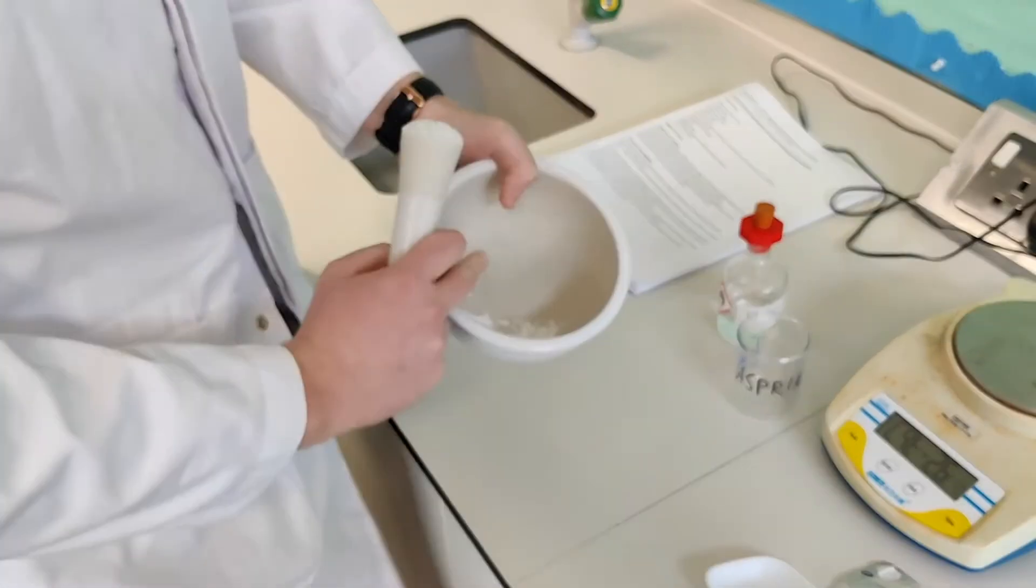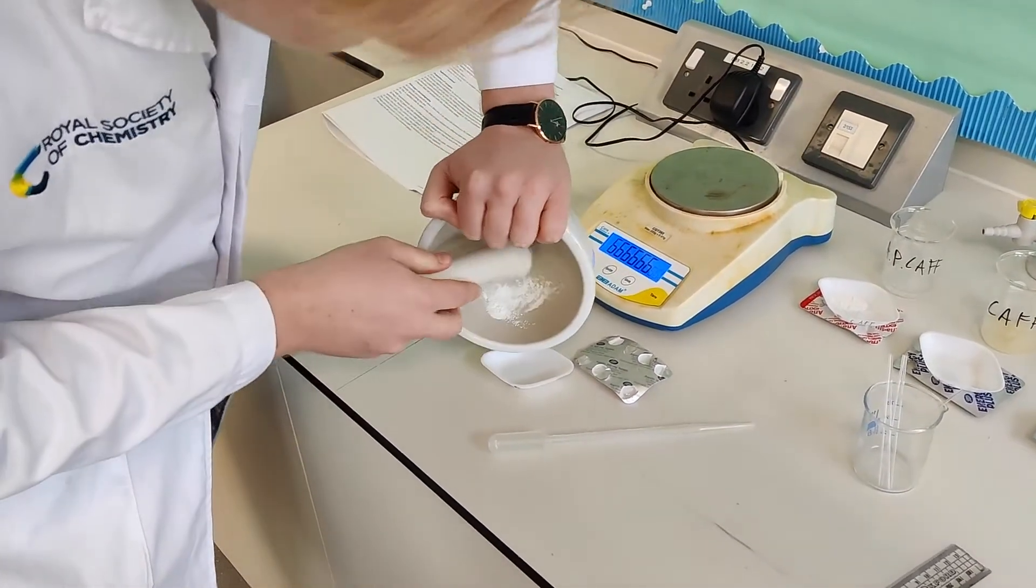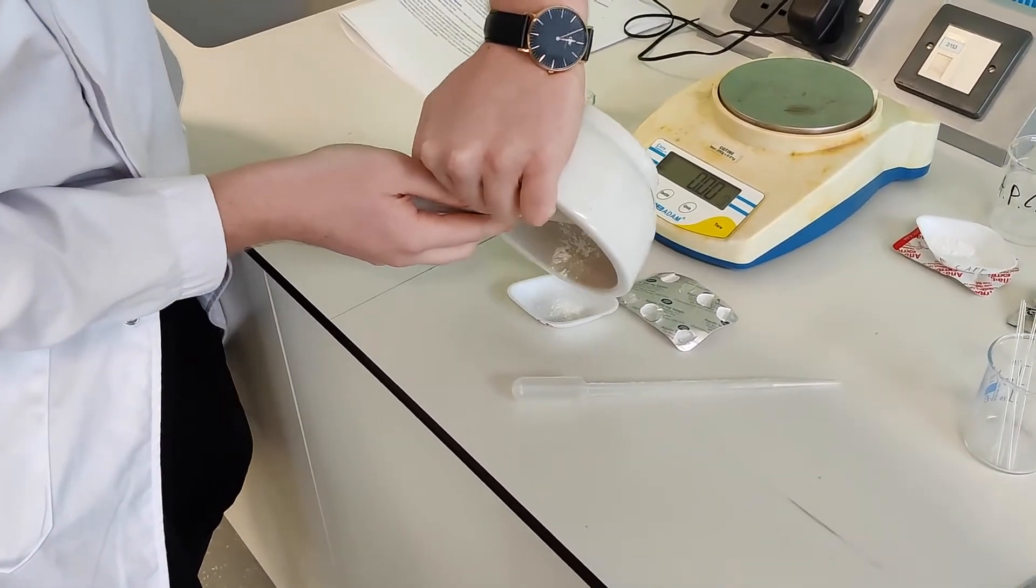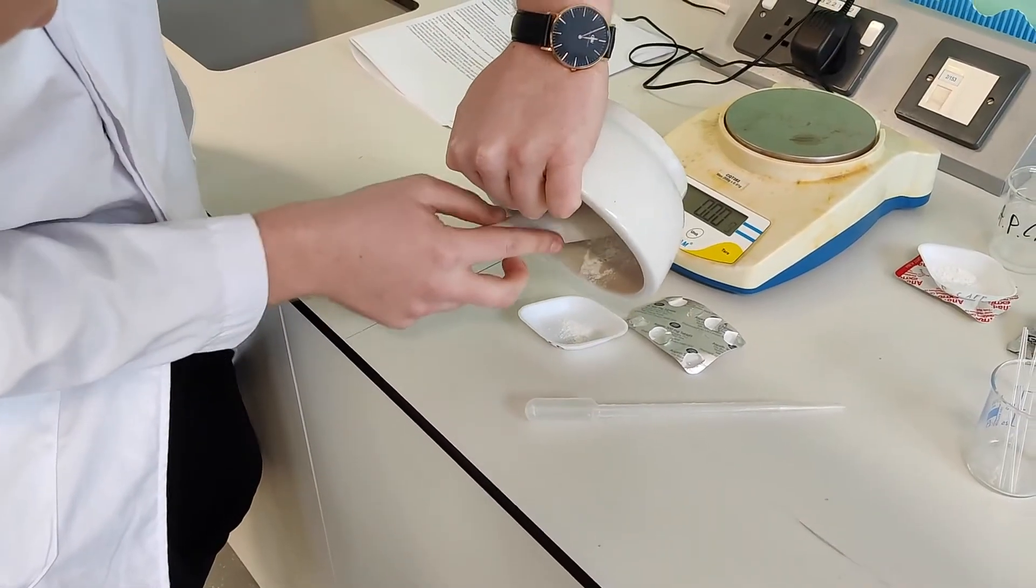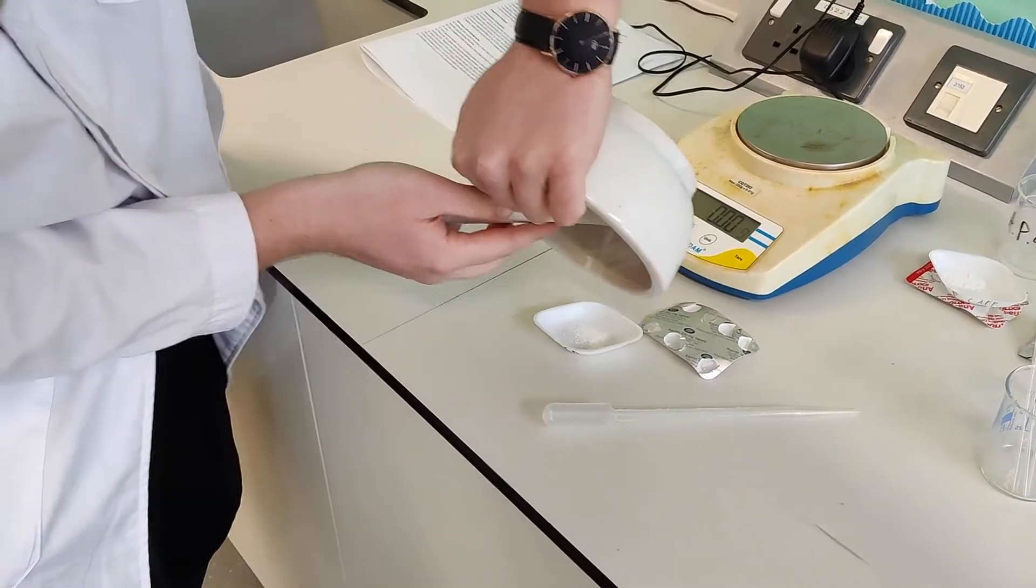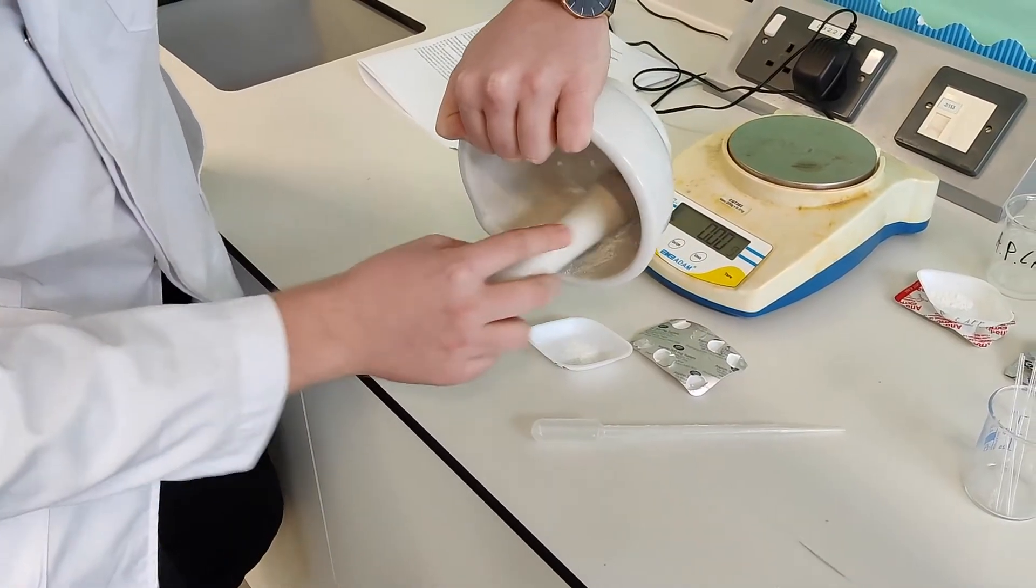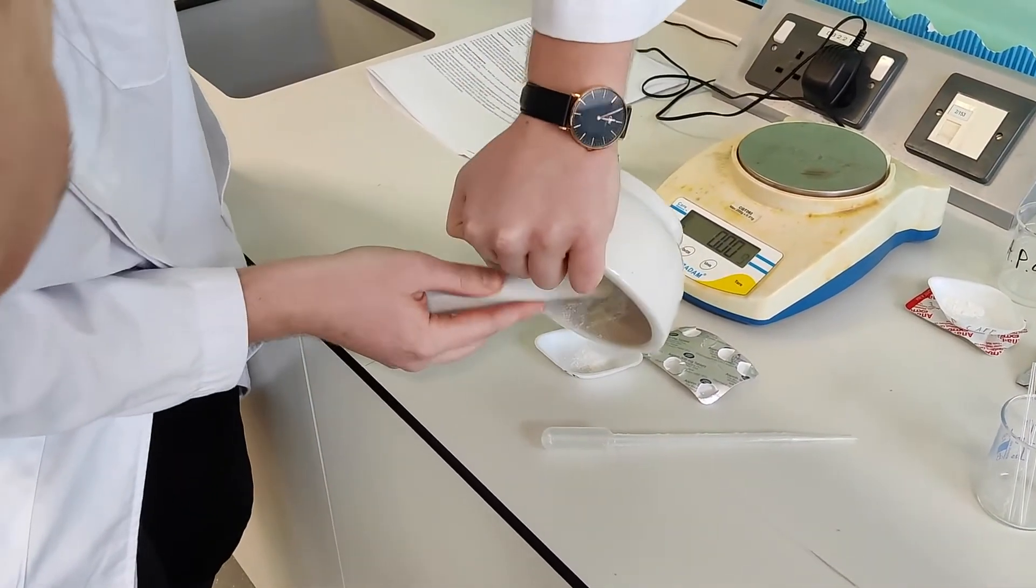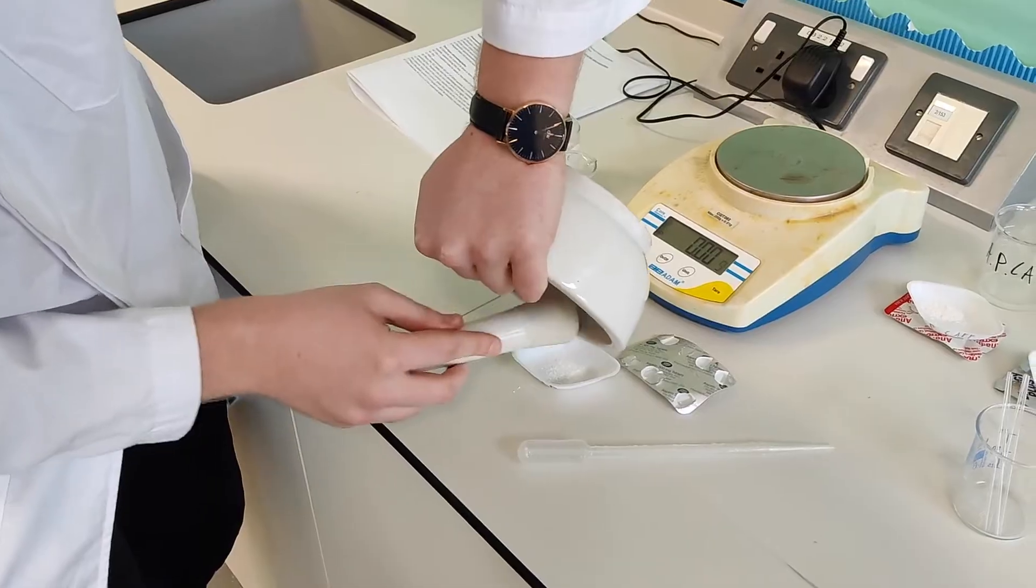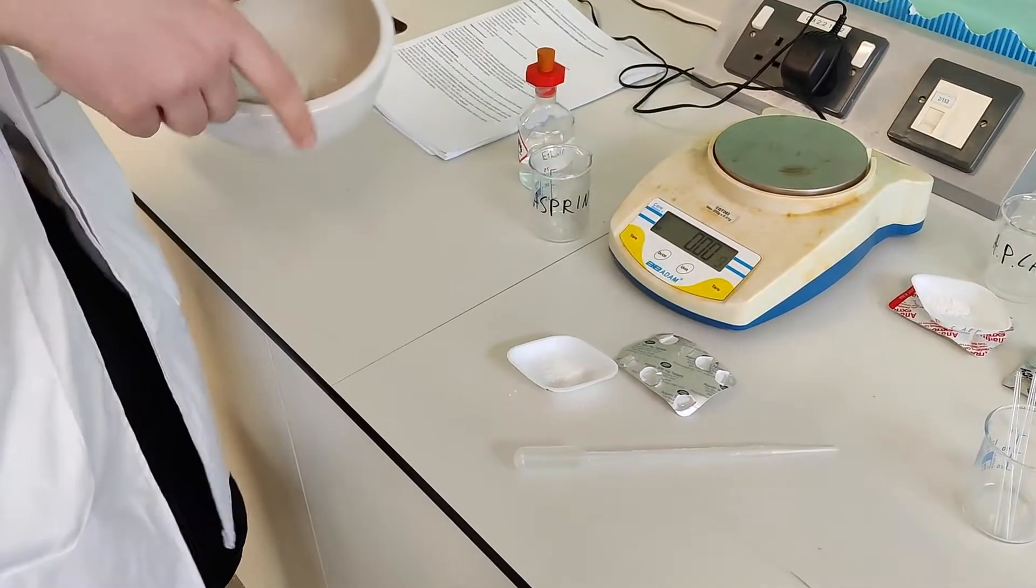So I'm going to place this aspirin, this crushed aspirin, into this weighing boat. The reason why I'm doing this is because I have more control of how much aspirin is actually placed into the beaker. It's quite hard, as you can see now, to control the amount of aspirin. We can see that it's quite difficult. It comes out from all sides. So it's a good idea to get it into the weighing boat first.